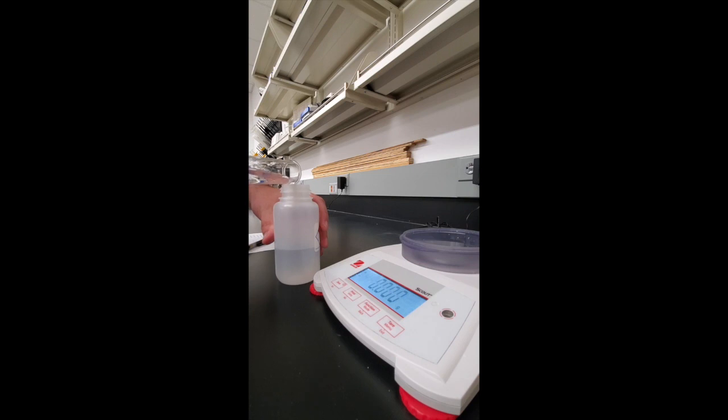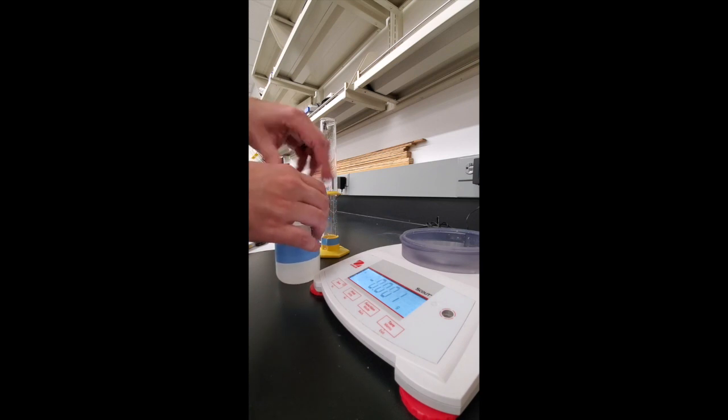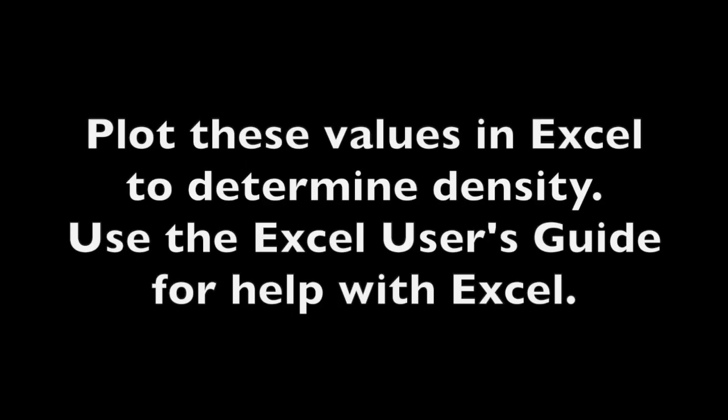Now all of the solution can be poured back into the original container. Plot these data in Excel to determine the densities of both of the unknown solutions.